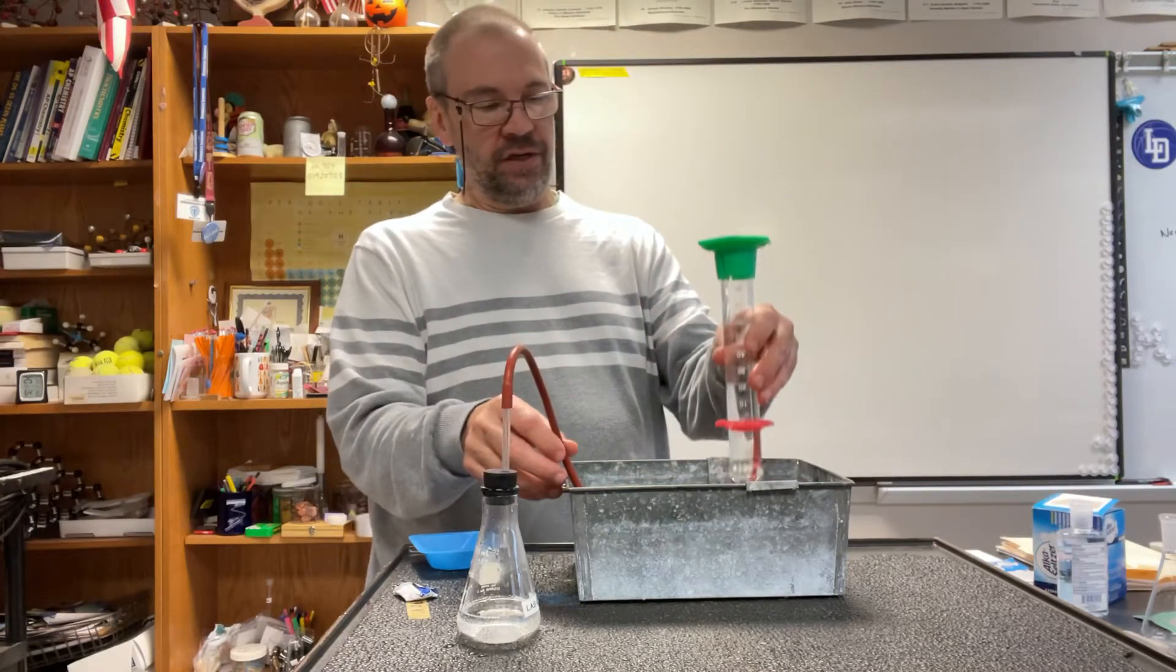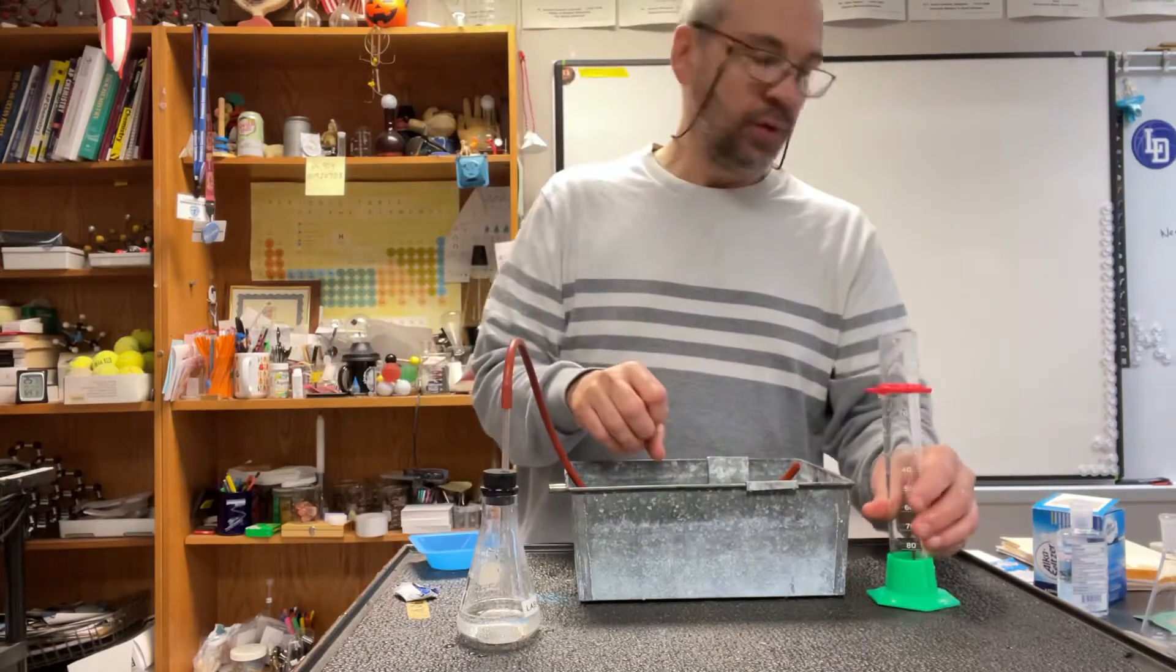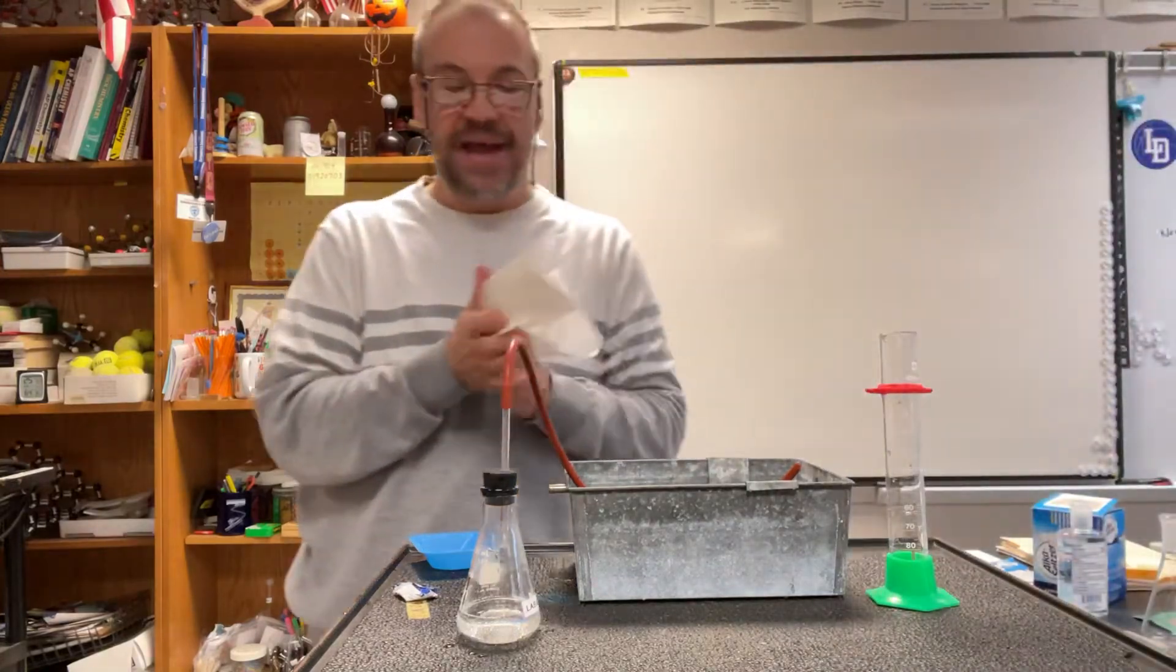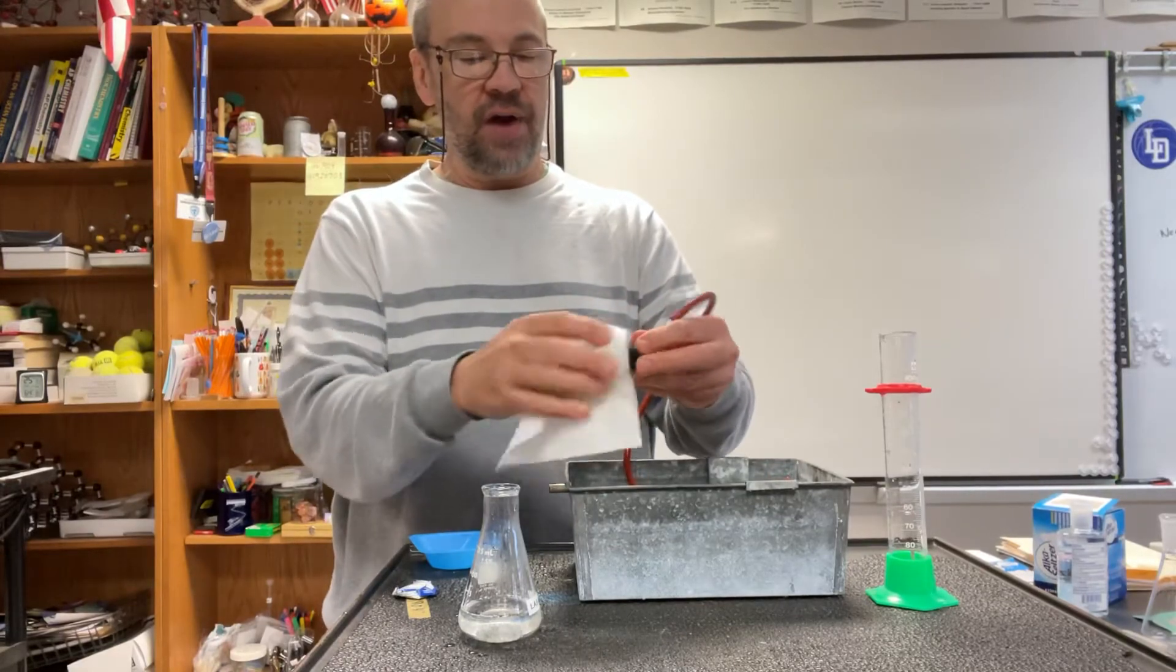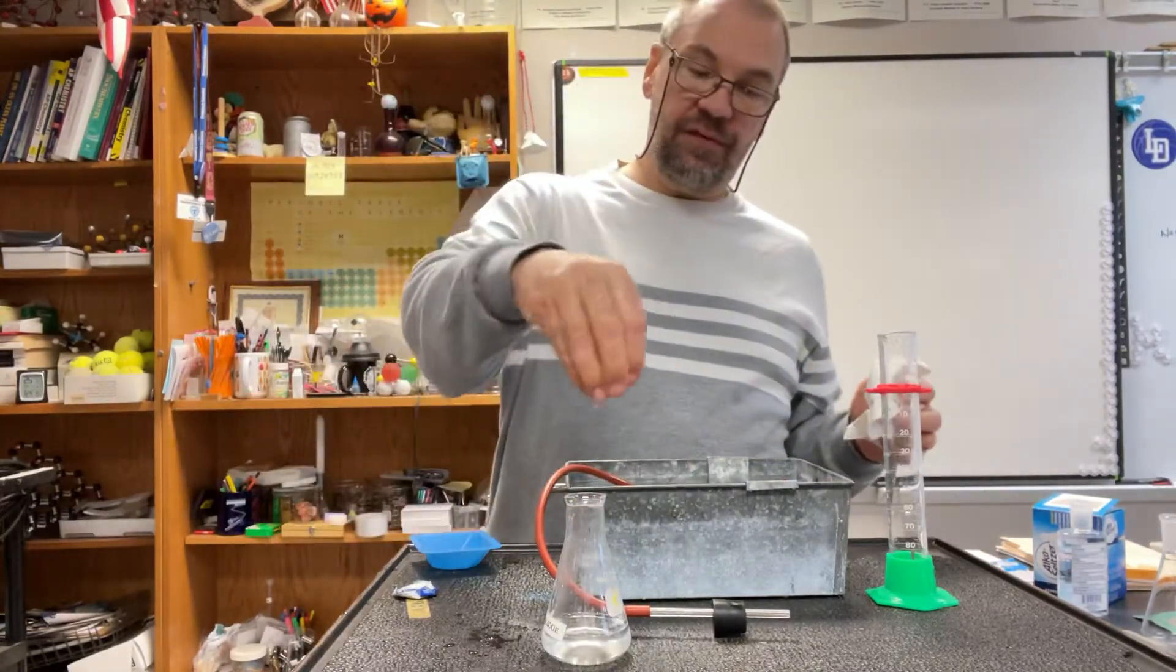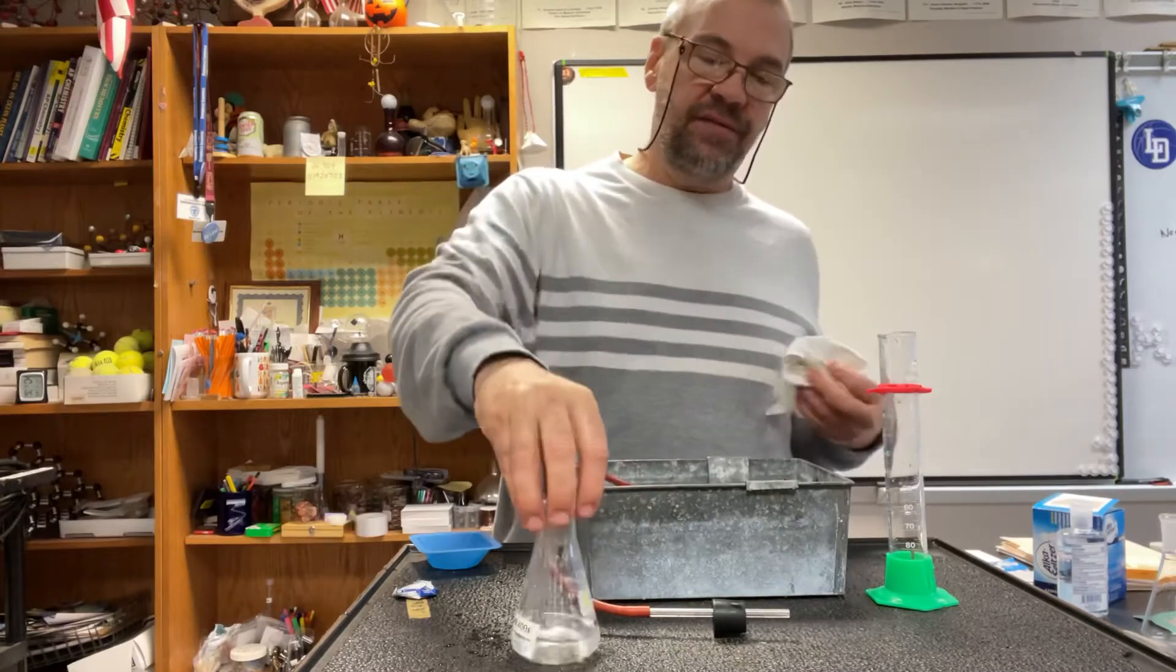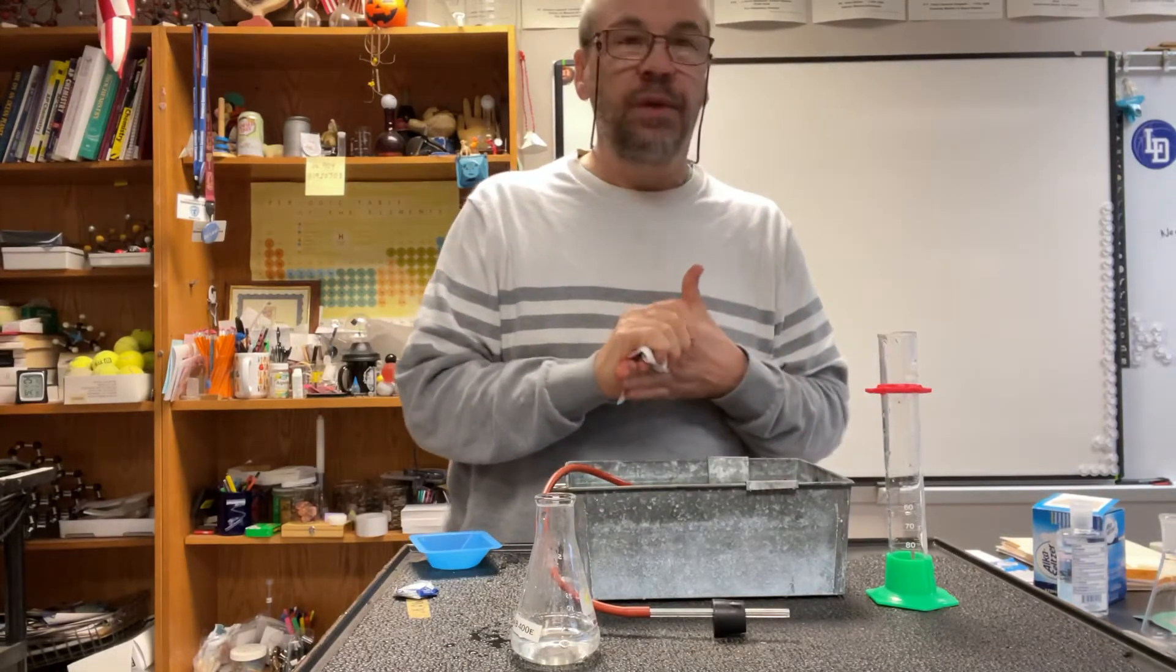When you're done, you can just go like that and the water will drain in, and then you can do another trial. Just make sure when you go to get your masses, everything should be dry. You want to make sure the Erlenmeyer flask is dry, because if you drip water on the flask, now you've changed the mass of that flask. All right, so we'll see how this goes.